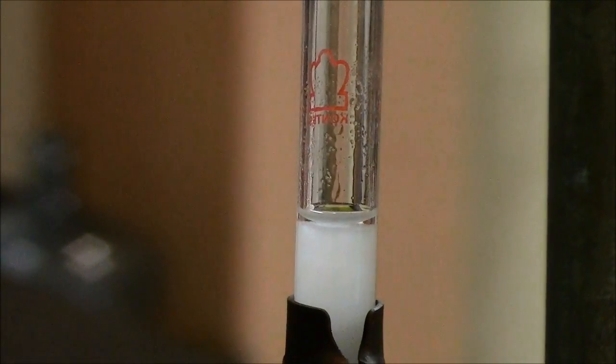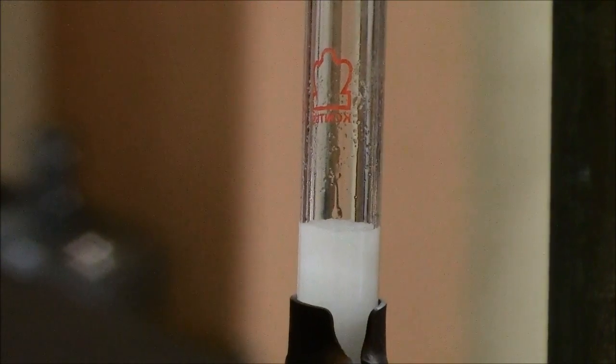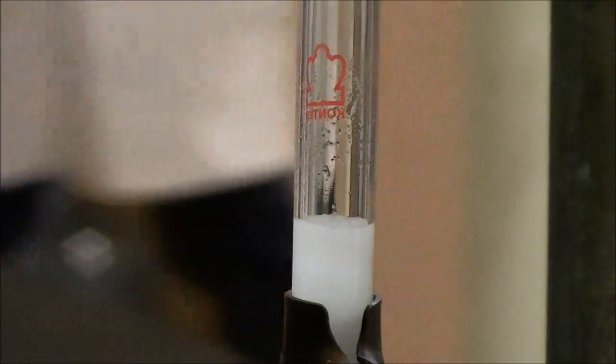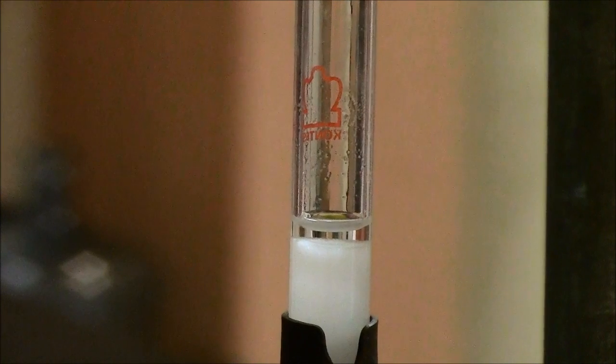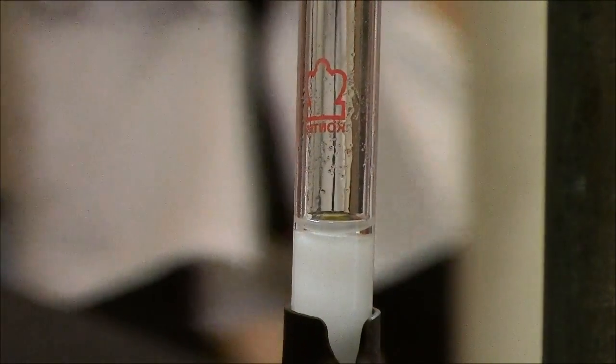Okay, so let's drain that into the silica now. That looks great. So in theory, this should be making it sort of a clean layer on top. The first top millimeter of silica will now be clean because your molecules have been pushed in. Okay. Alright, so repeat that. Okay, good. So let's put that into the silica now. So far you've added 6 just to the top.